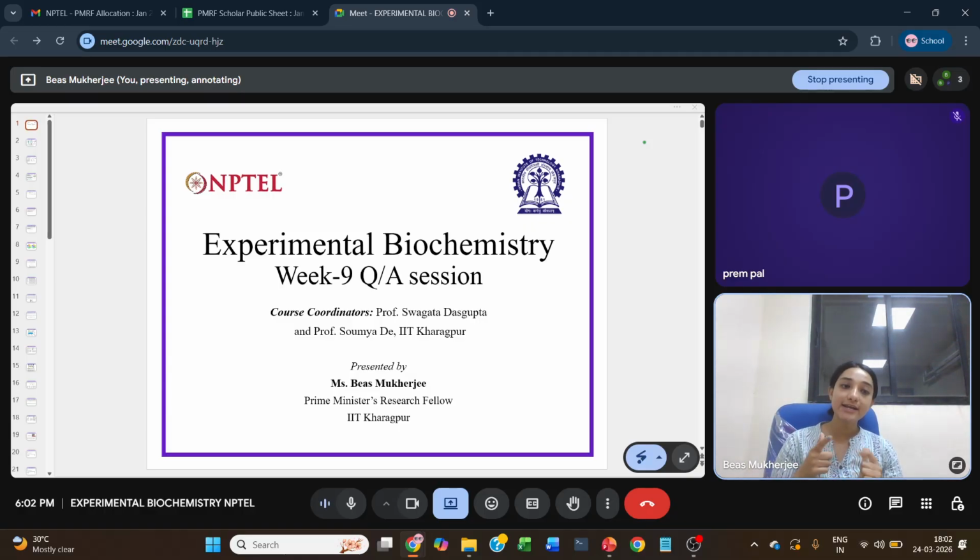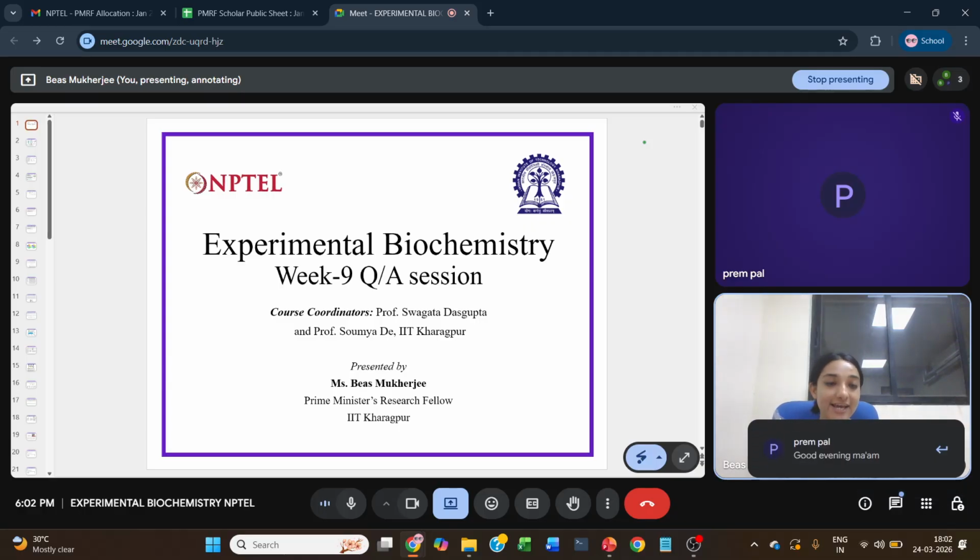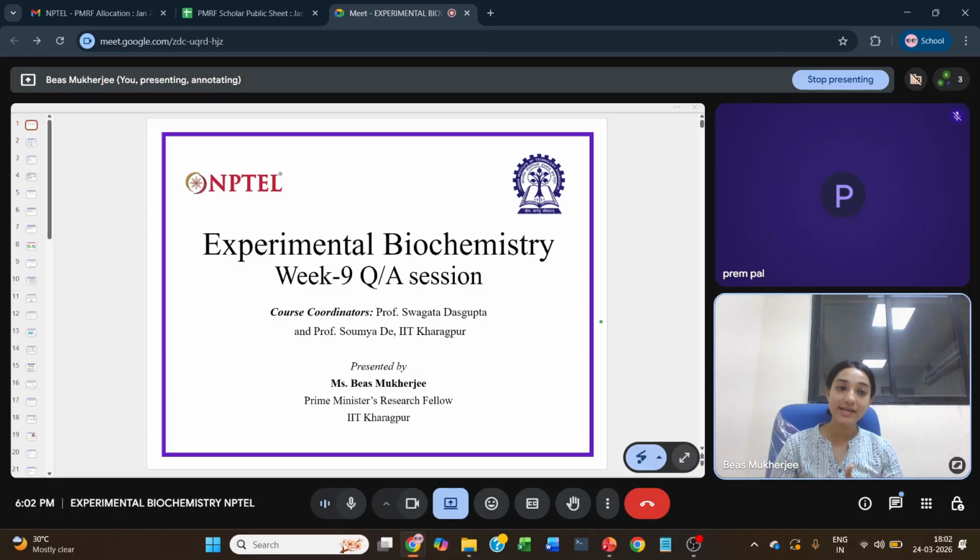Okay, so RNA and DNA isolation, the different strategies that are used, and these two topics are once again very important for your exams. Let's start with today's class. In today's class, we are going to talk about extraction of nucleic acids, extraction and purification of DNA and RNA. Okay, right. So let's begin.